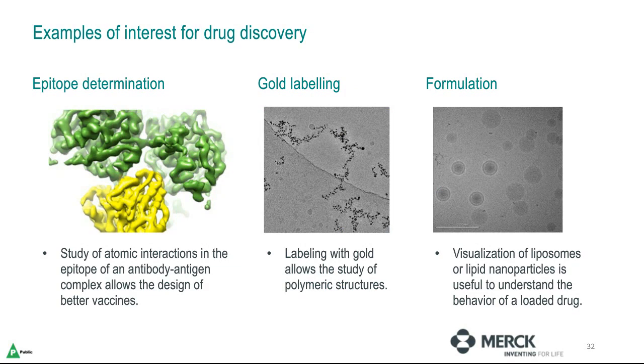Beyond the use of small molecules as drugs, pharmaceutical companies also use immunology and our own immune system through different ways to help us fighting the diseases. CryoEM can also be a great advantage for them by being able to study the interaction of proteins with therapeutic antibodies, what are called antibody-based drugs. An antibody is just another type of protein, and you can see an example in the image at the left, where the antibody is yellow and the target protein is green.